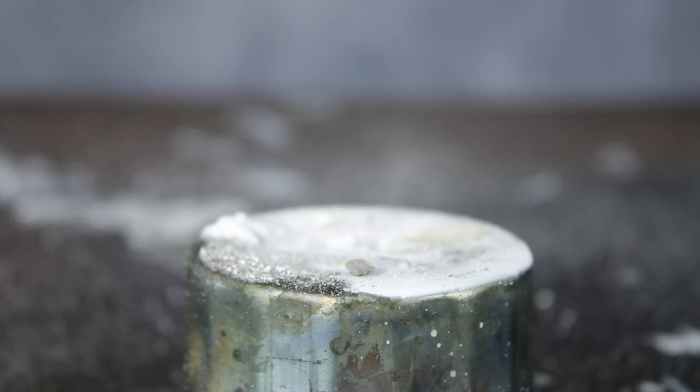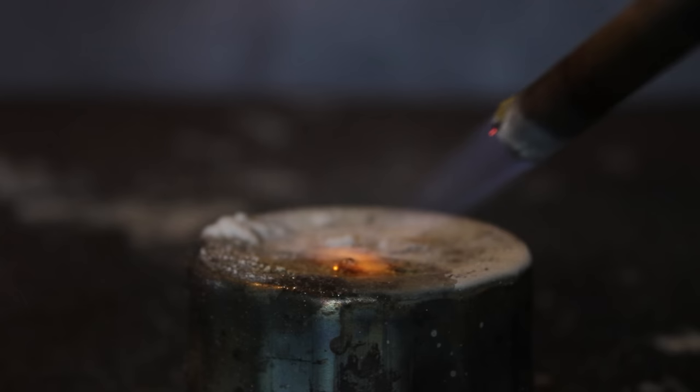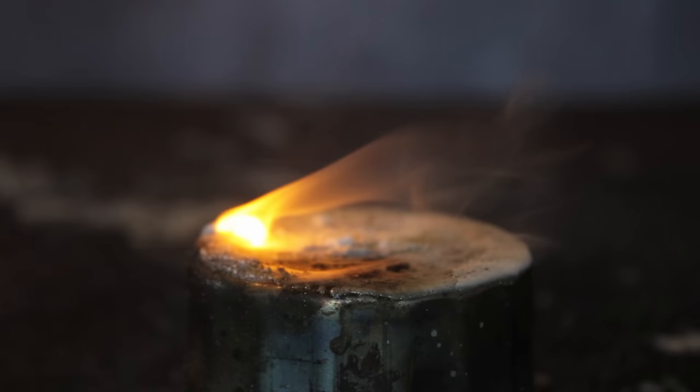Quick bonus reaction: I didn't have a lot of sodium at the time, but I did manage to salvage this small piece, which surprisingly didn't explode on contact with the acid until I heated it up with my blowtorch.